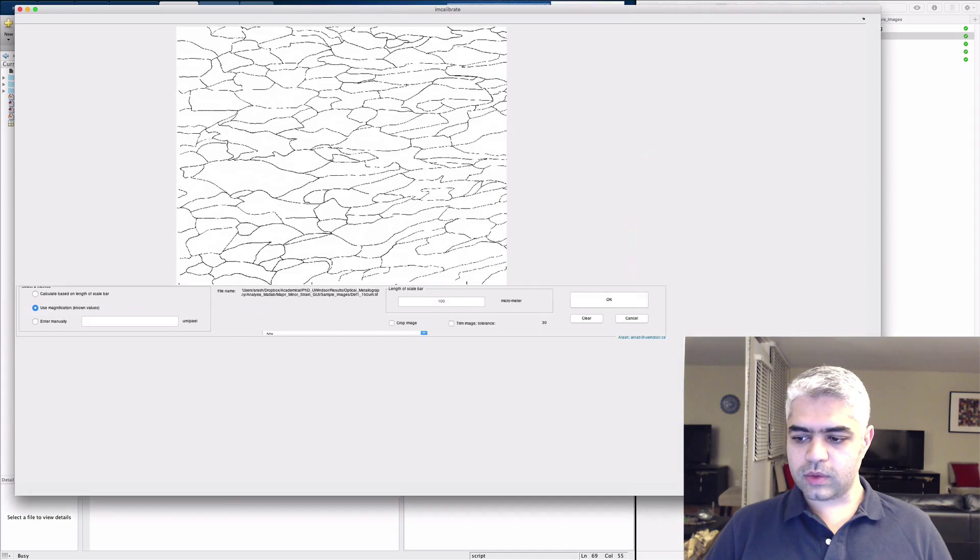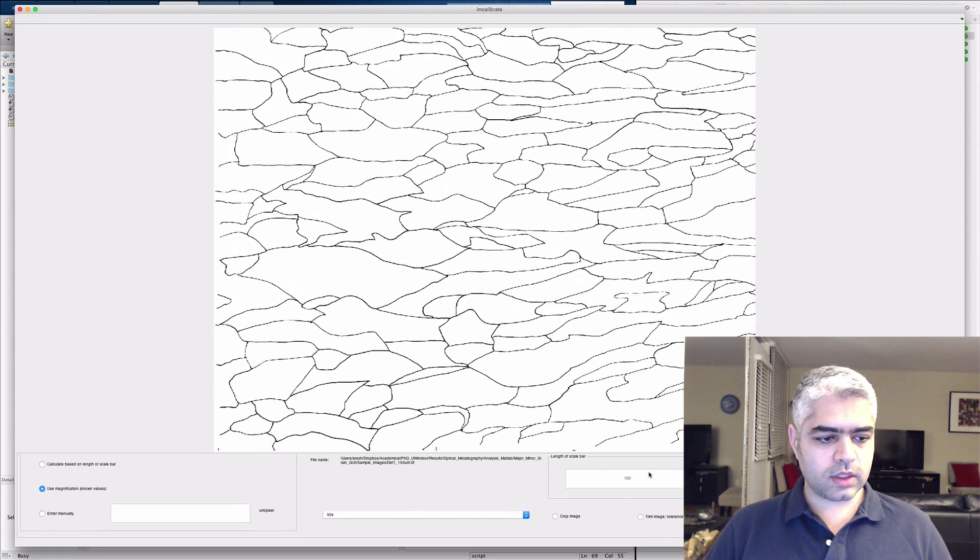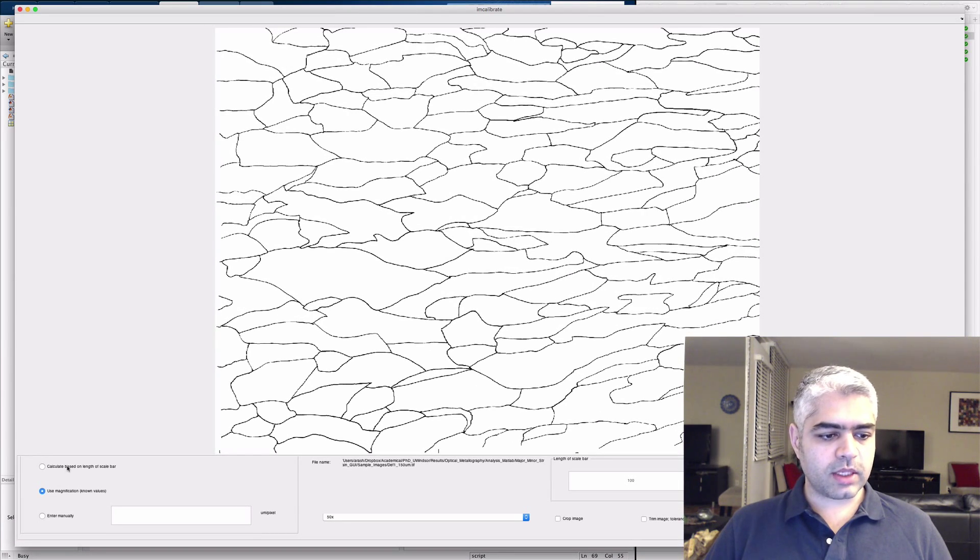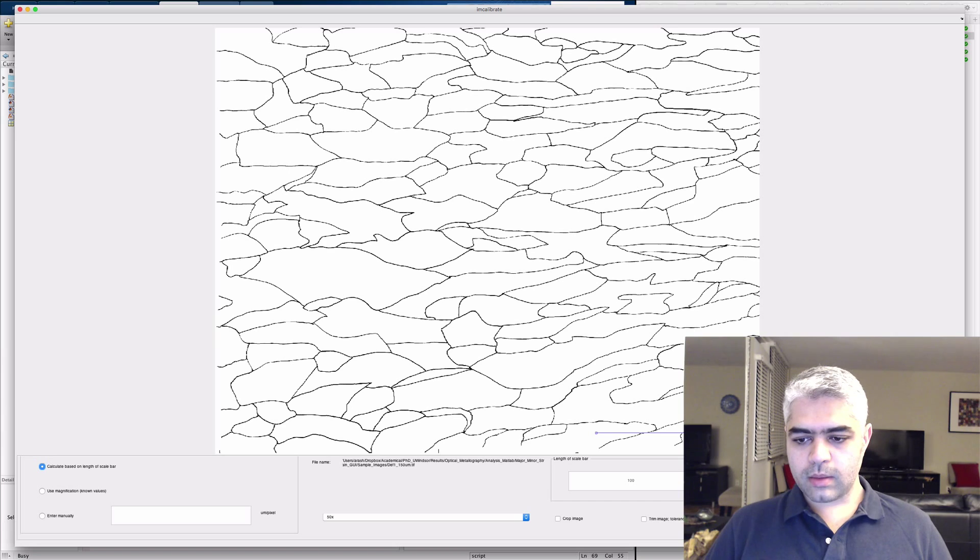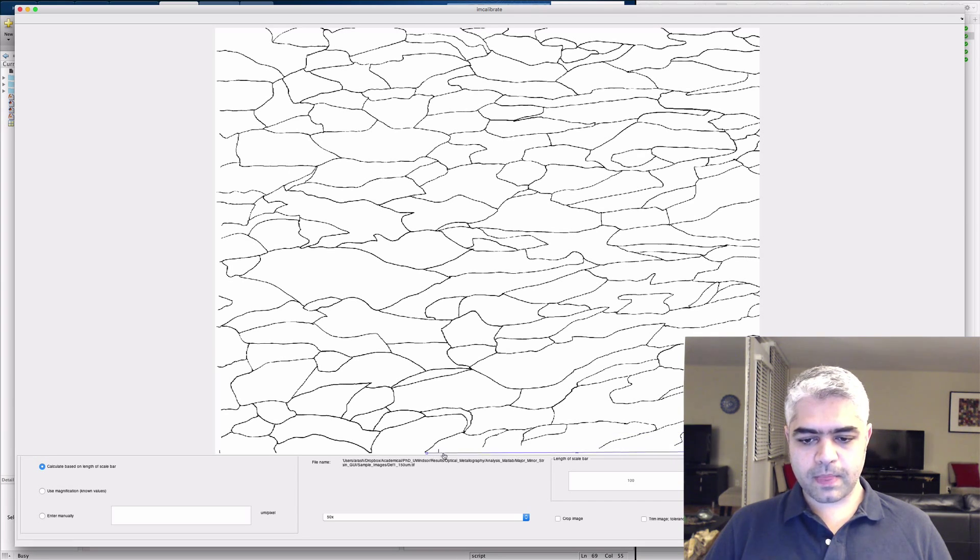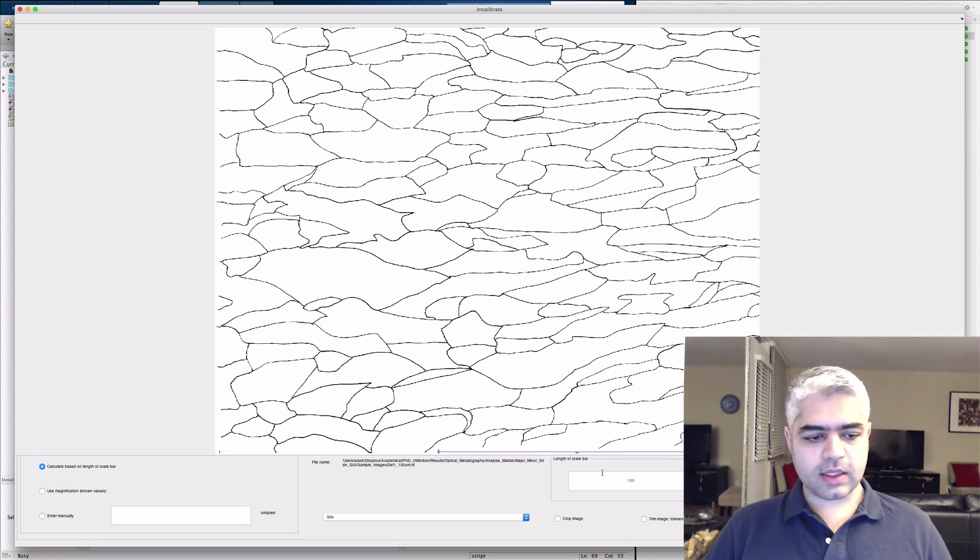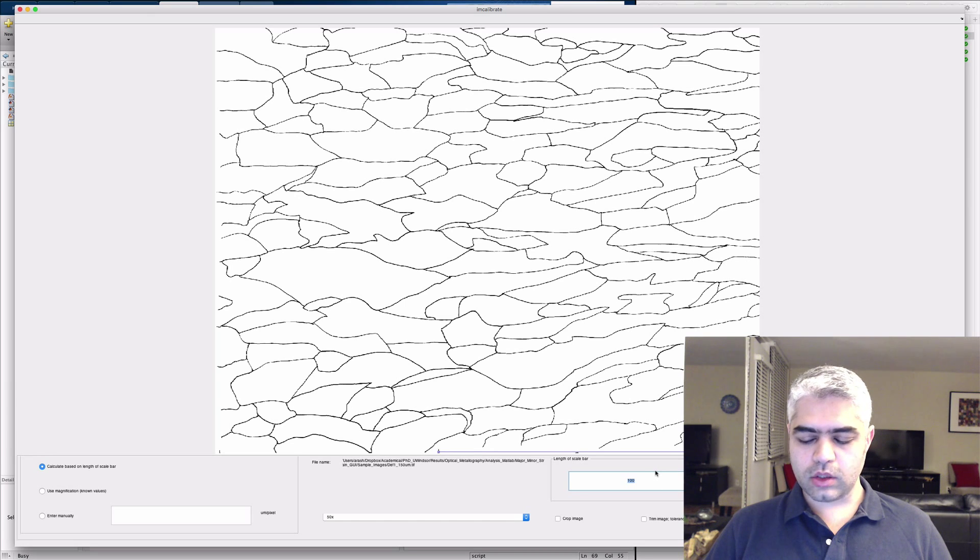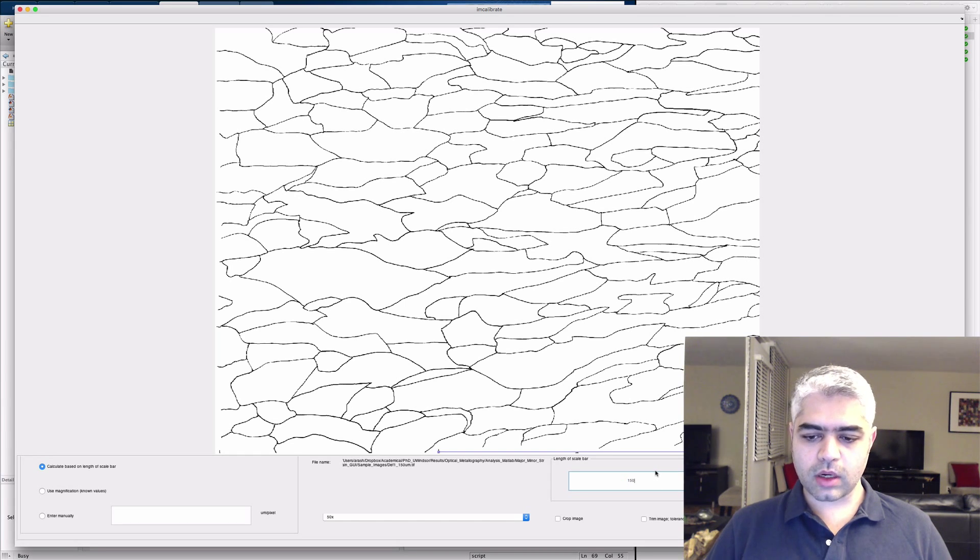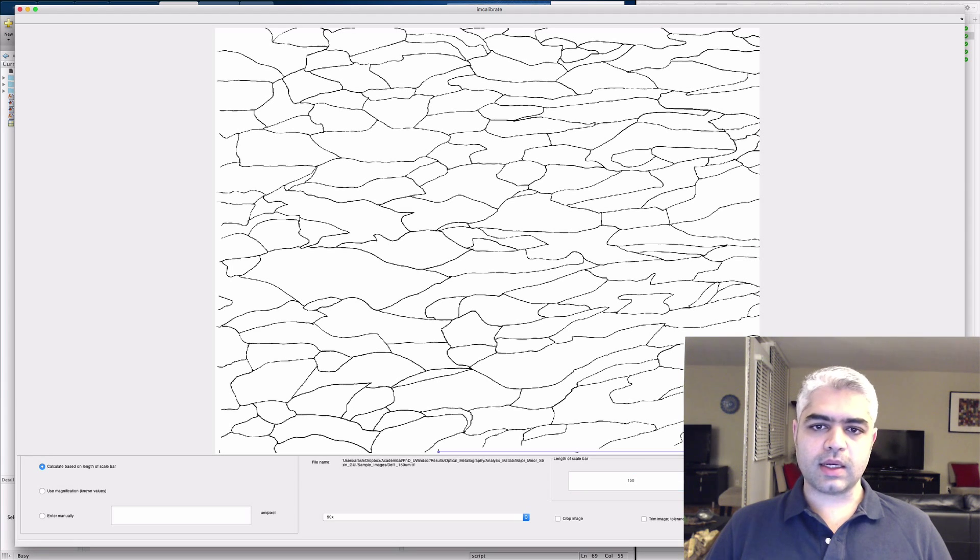And then again you can resize this image if you want. Calculate based on the length of the scale bar, place the scale bar at the position that you want, extend the length of it. OK, and then change the value. I know that this is 150 microns, so I'm changing this value to 150 and then click OK.